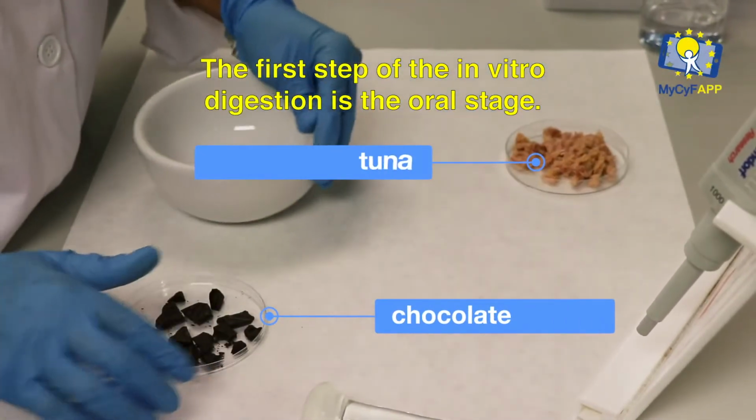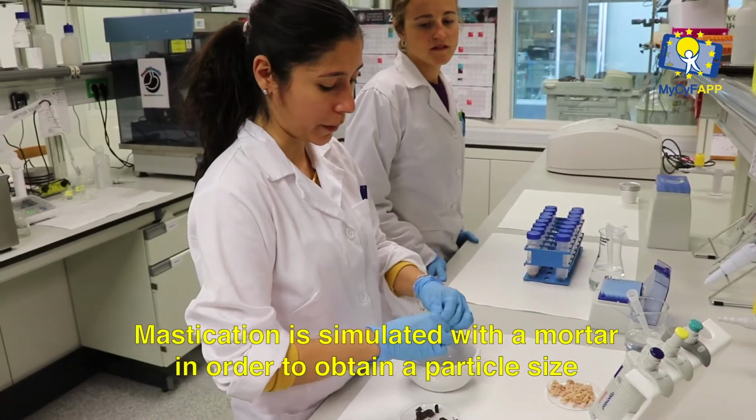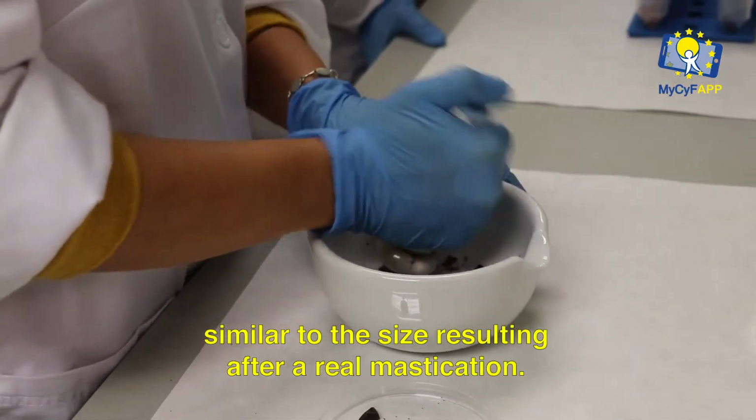The first step of the in vitro digestion is the oral stage. Mastication is simulated with a mortar in order to obtain a particle size similar to the size resulting after a real mastication.